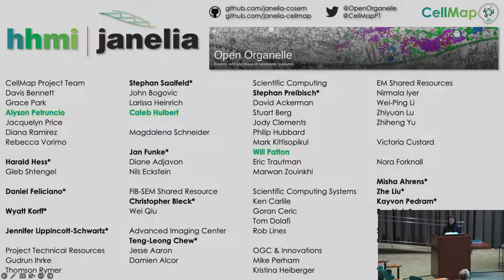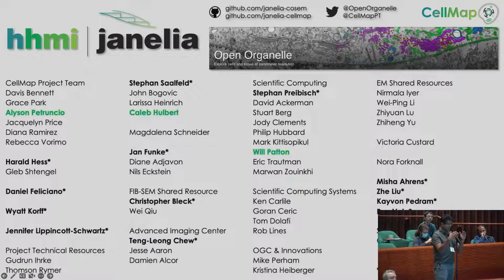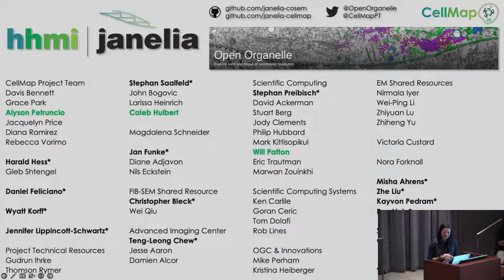But do you have some sense as to what fraction of the voxels inside of a cell are unclassified and therefore potentially new organelles? Okay. So within the HeLa cell, I'd say that we have really covered a large part of it. And what's not classified is actually stuff that we know, so not as exciting. It's the other cytoskeletal filaments, like actin and intermediate filaments, and we're exploring ways to segment them more routinely. But in the boring HeLa cell situation, there's nothing too exciting yet, but maybe when we get into tissue, there will be more.